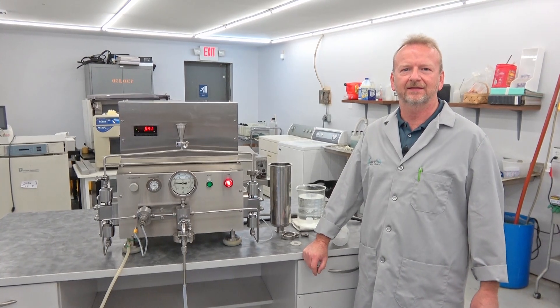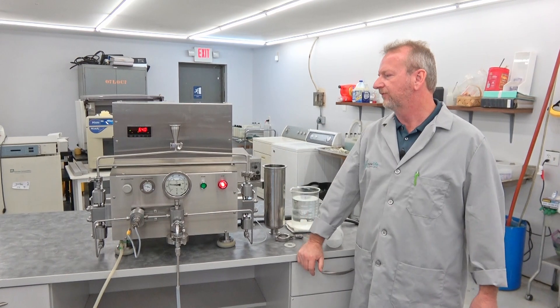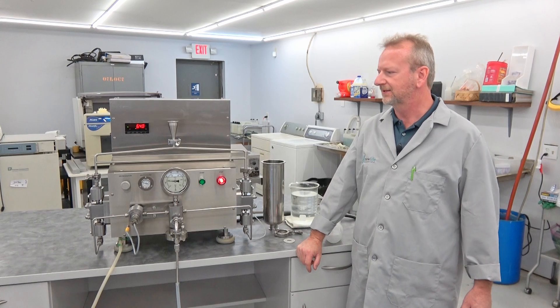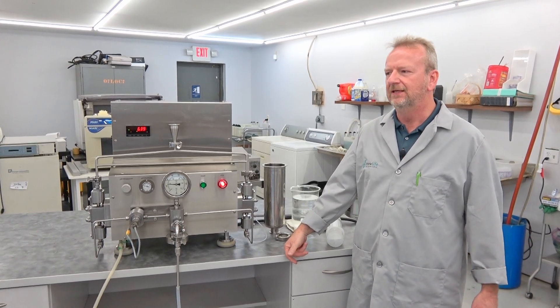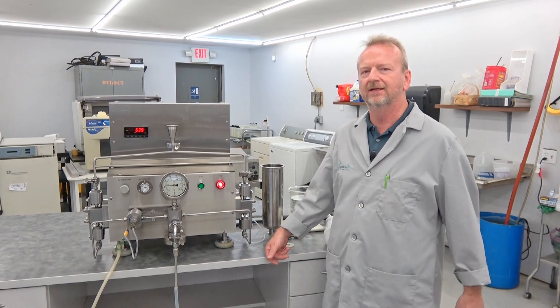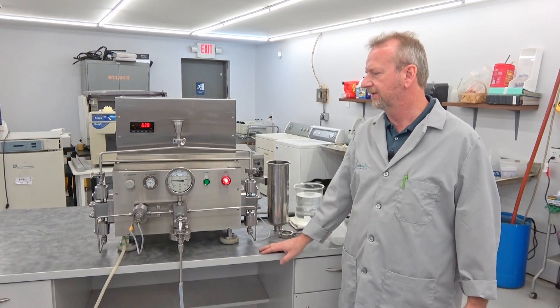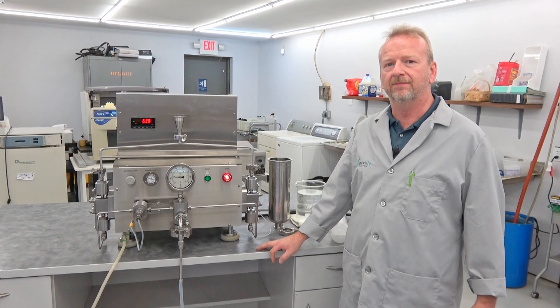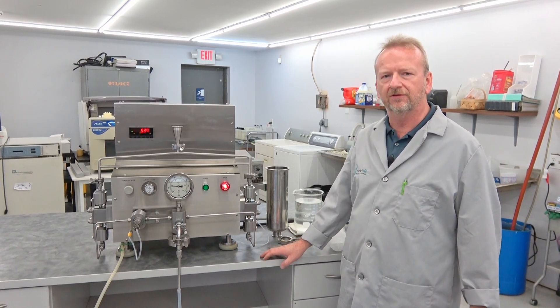Hi, I'm Rich here at New Life Scientific. Today I'm in the back of the building because our high voltage connection is on the back end where we do our cleaning. I wanted to do a video of this high voltage machine — this is an Emulsiflex D20B, made by Avestin up in Canada. They're very well known for building quality machines. This one has a 20 liter per hour capacity and is a 30,000 PSI machine, very comparable to microfluidics.